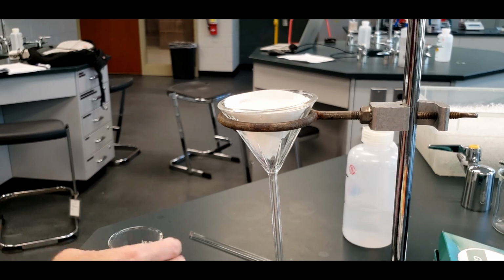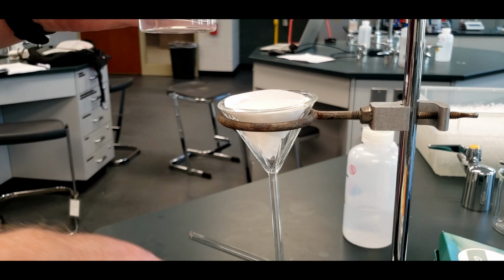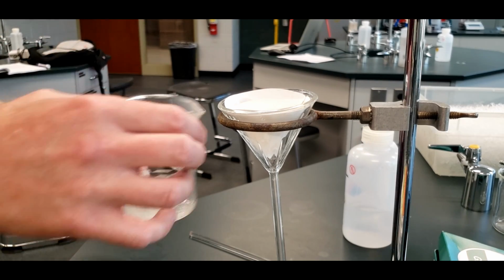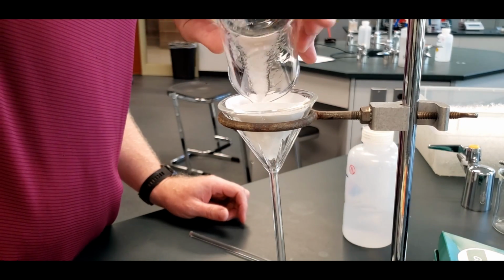Next, we're going to add in this mixture here. The trick is that you want as little saltwater solution going through as possible, because we're going to have to evaporate that. So it takes a long time to do that, so we don't want to put a gallon of water behind this to wash it through. So what I'm going to do first is just swirl it and get as much of it in here as I can.